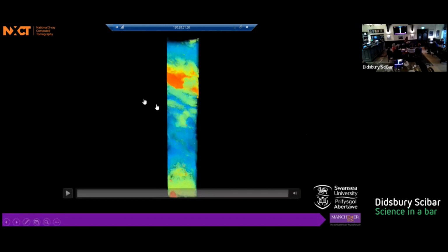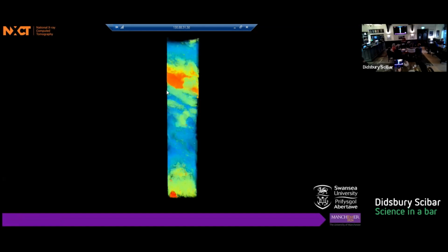So this is a sediment core from the North Sea. About 6,000 years BC, there was a huge tsunami-inducing landslide called the Storegga landslide. And it produced a massive tidal wave, obviously, a tsunami, that inundated the Norwegian coast, a lot of Scotland and the islands, etc., all the way down. And it left a deposit of sediment, really thick, huge, meters and meters of sediment.